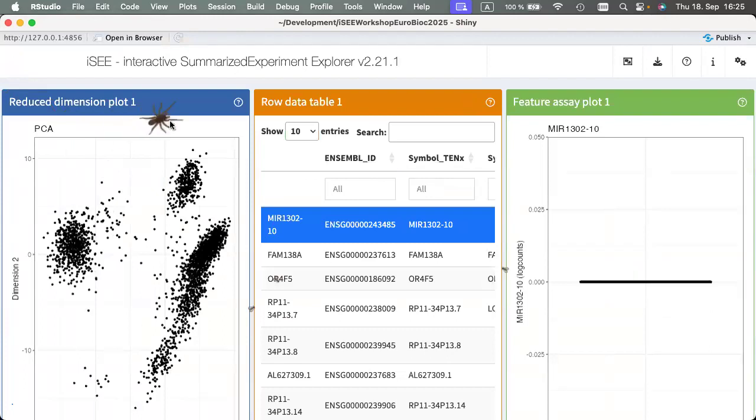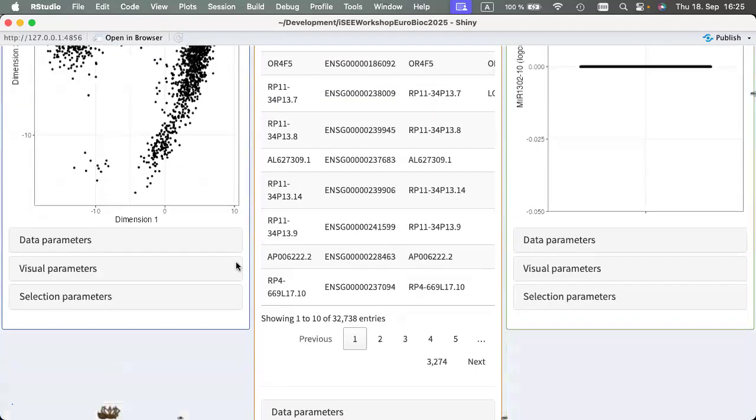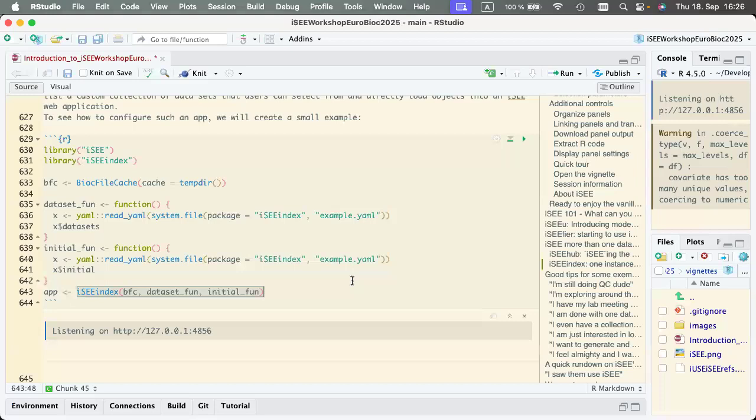And if you click on those, they fall down. So you can kill them. I don't know if it's against the code of conduct in terms of animal harming, but that's how you can have bugs within iSEE. You enjoyed that initializing, right? Yes. I mean, okay. Fun fact and not a fun fact.